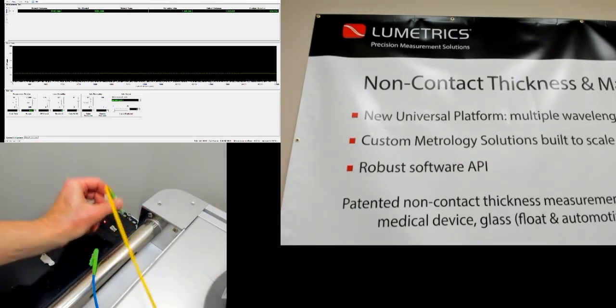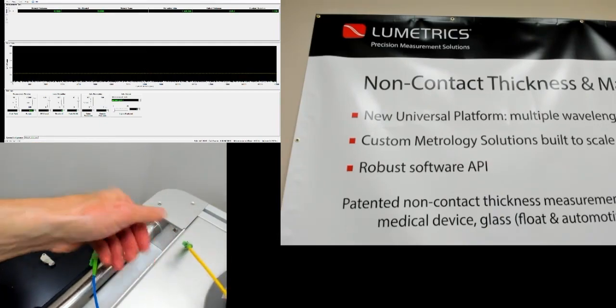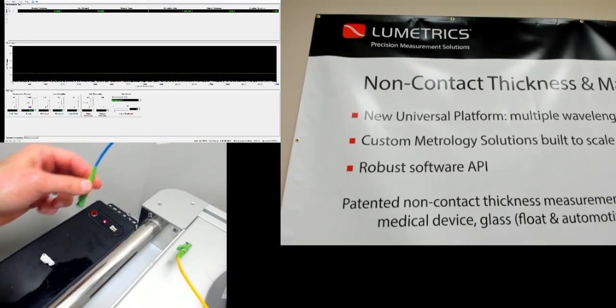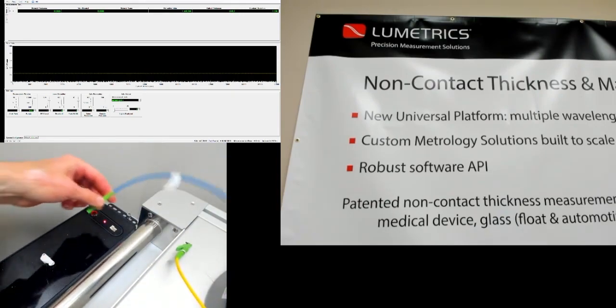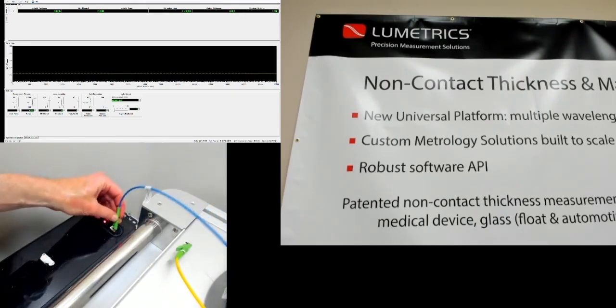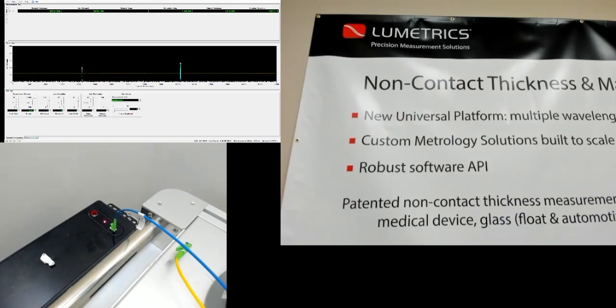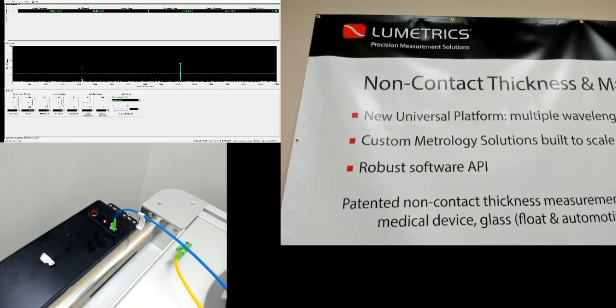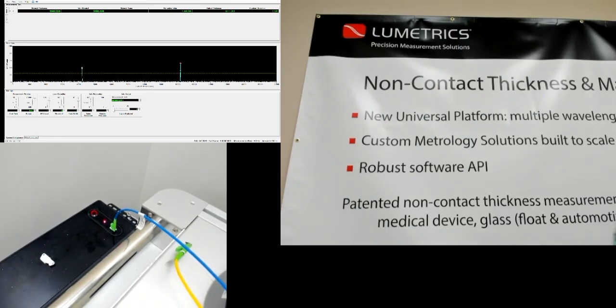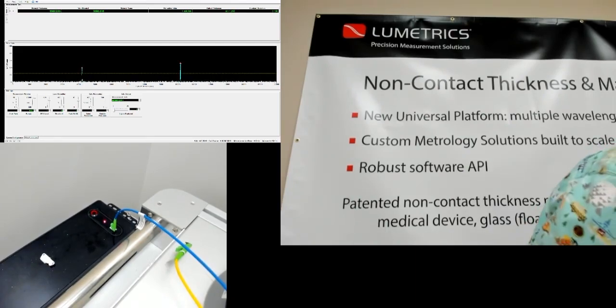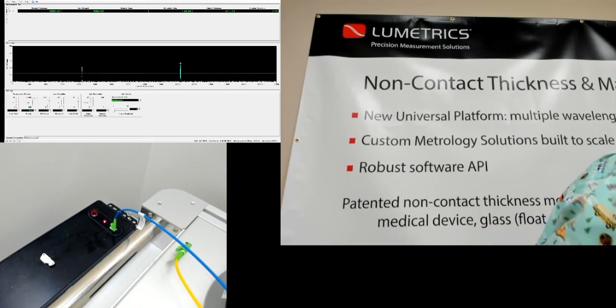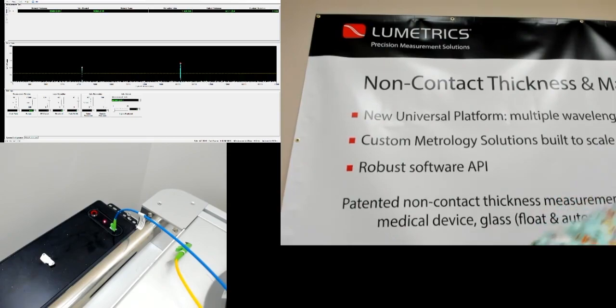You unplug the probe, the measurement probe, and you plug in the verification probe. And now we are measuring the verification probe. So we didn't have to stop the software or pause anything. You can do that hot swap if you like.